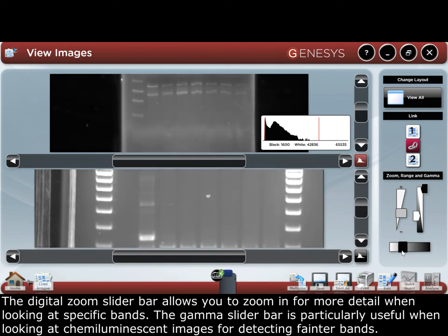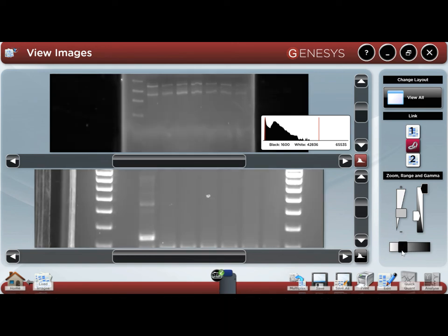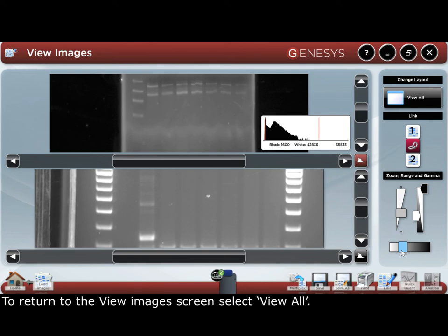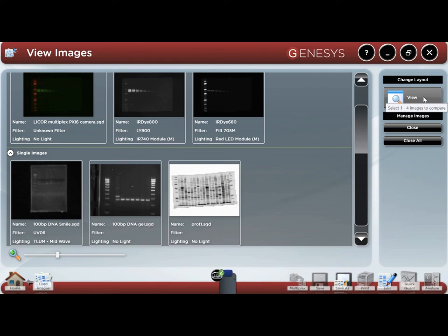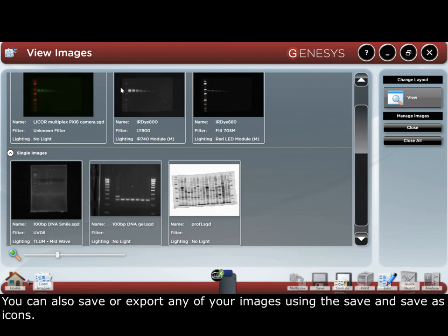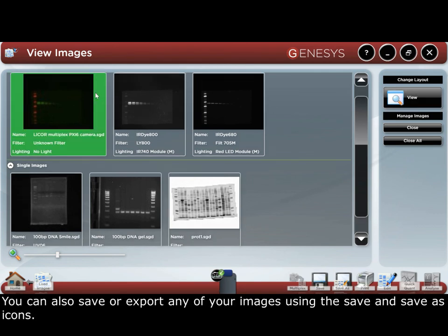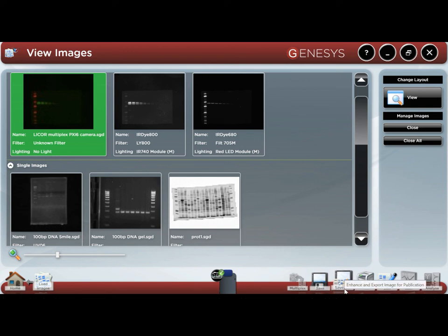The gamma slider bar is particularly useful when looking at fluorescent images for detecting fainter bands. To return to the view images screen, select view all. You can also save or export any of your images using the save and save as icons.